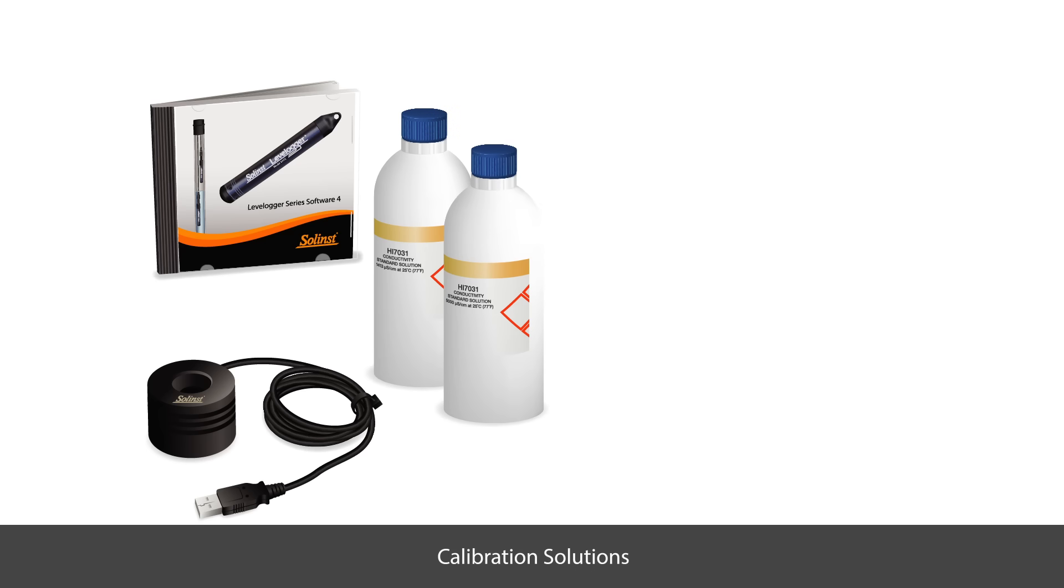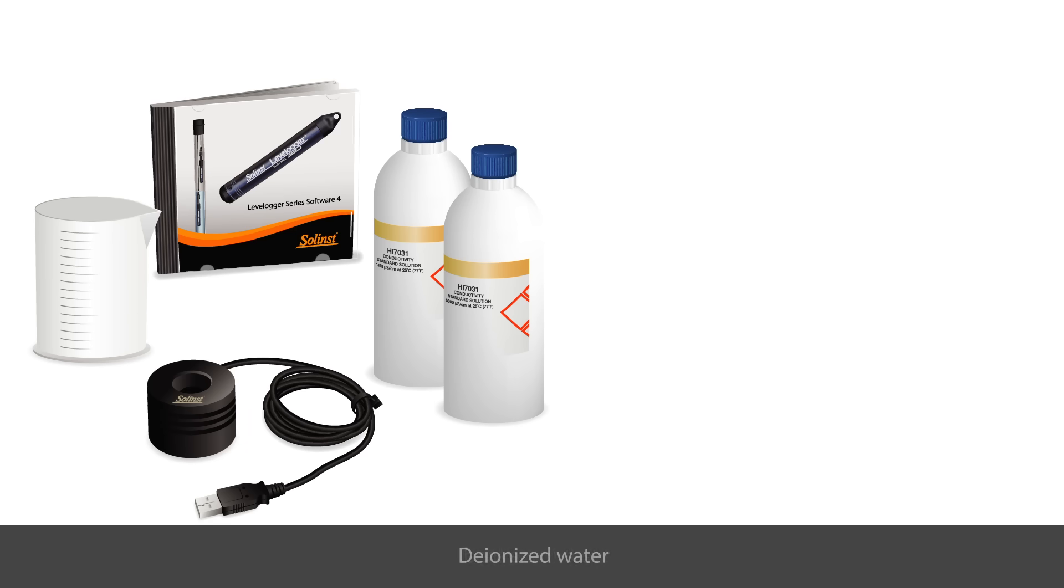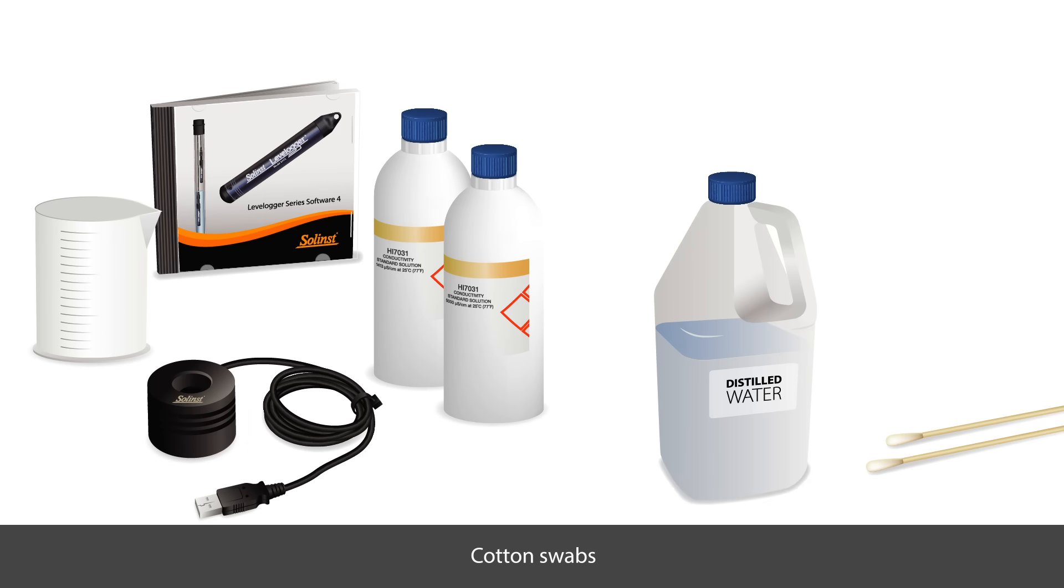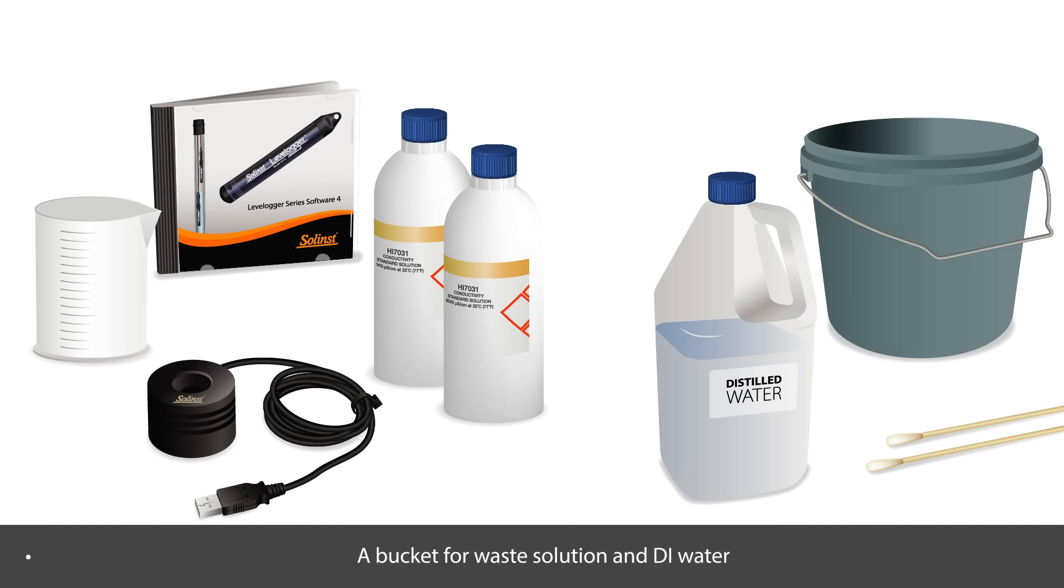You will also need calibration solutions, clear beakers or cylinders to hold the LTC during calibration, deionized water, cotton swabs, a bucket for waste solution and DI water, and clean paper towels or cloths.